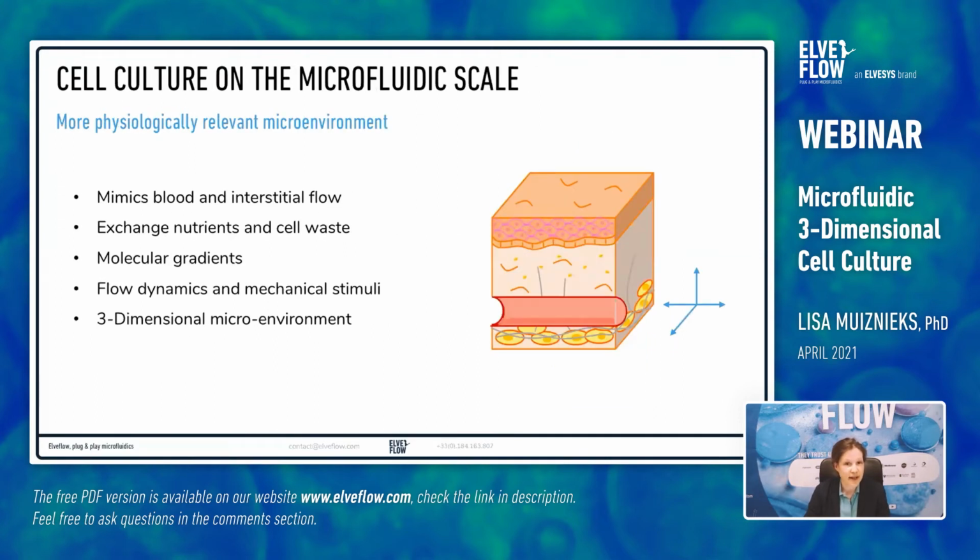Firstly, why use microfluidics for cell culture? While 2D culture platforms have been widely used for decades, they are greatly limited in capturing the physiological relevance of living organisms. Tissues are comprised of a dense and crowded milieu of cells, matrix fibers, dynamic fluids, and fluidic channels. Microfluidics is perfectly suited to adding some of these topological, mechanical, and fluidic stimuli to cells in culture to increase the physiological relevance of in vitro tissue models.